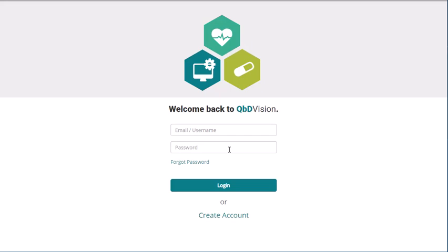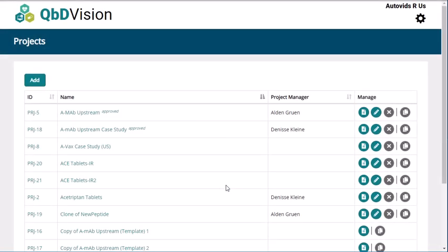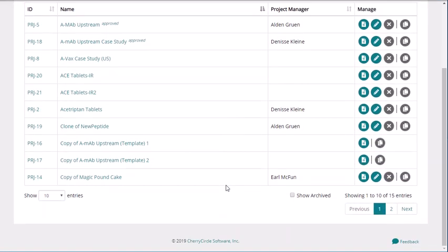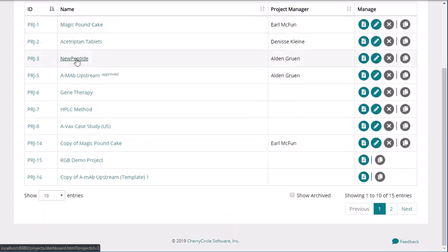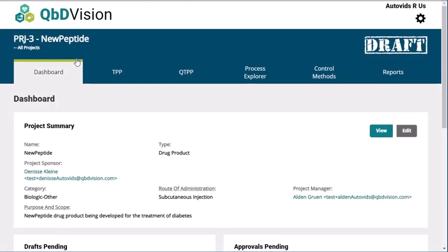This video will demonstrate the various uses of the quality attribute and requirement reports using our new peptide sample project. This project is available in your sandbox environment for exploration. To see the requirement reports available, navigate to the Reports tab within your project.